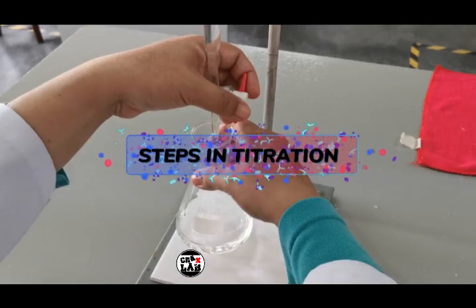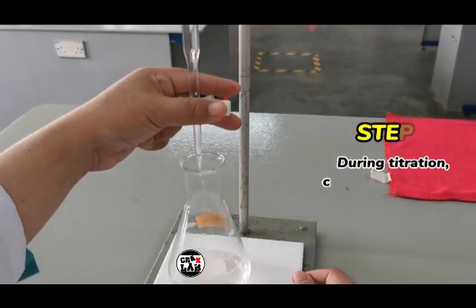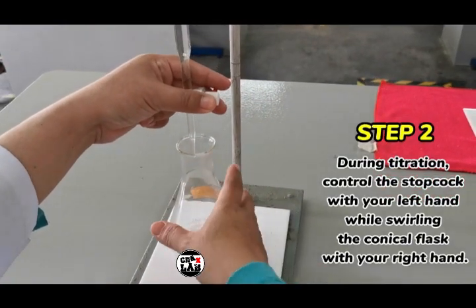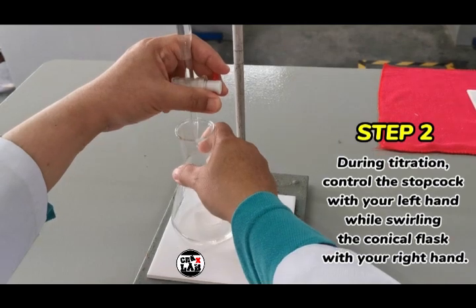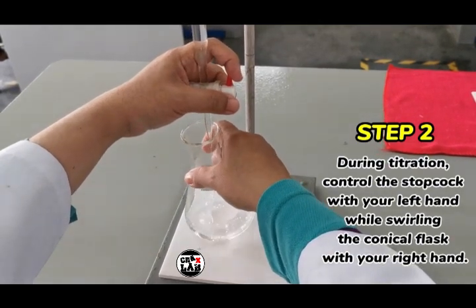Steps in titration. Step 1. Place a piece of white tile underneath a conical flask. Step 2. During titration, control the stopcock with your left hand while swirling the conical flask with your right hand.